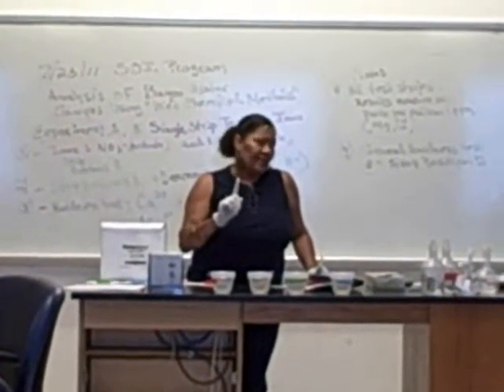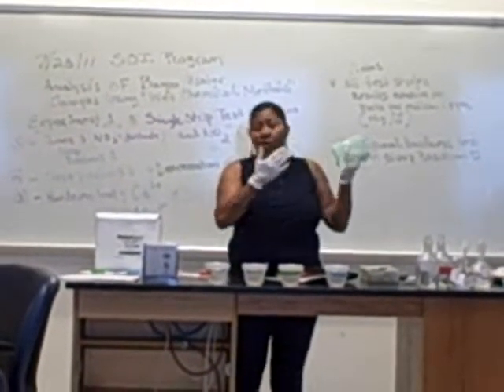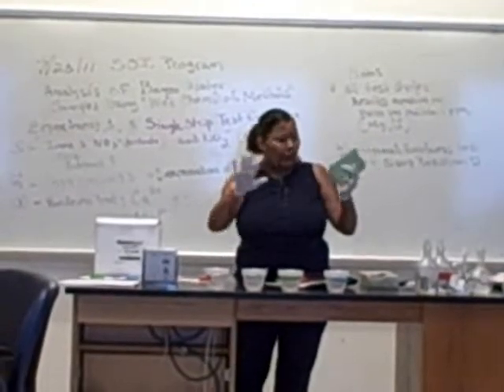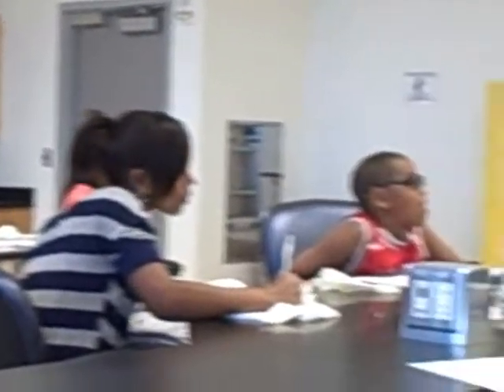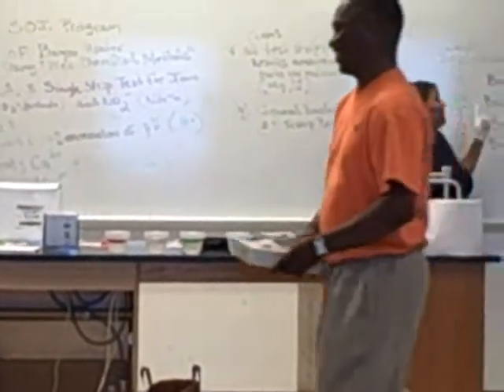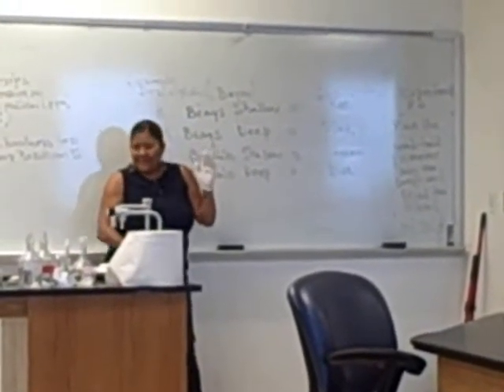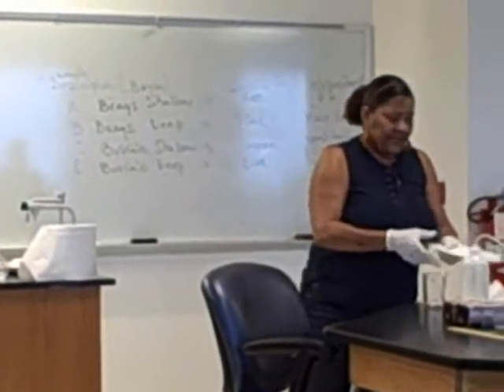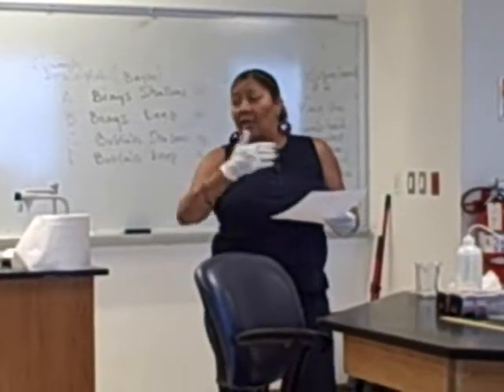What we're going to do this morning, we don't know what is in these 4 samples. Now, I want everyone at the tables with your back to me to turn this way so that I can show you a couple things up front. Kayla, turn this way, sweetheart. Now, the red tape is sample A. On the board, you will find the description of those samples. It comes from Brays Shallow, where we skimmed the surface and took a top sample. Now, yes, these samples are not divided by what group you're in. They're for all of us.